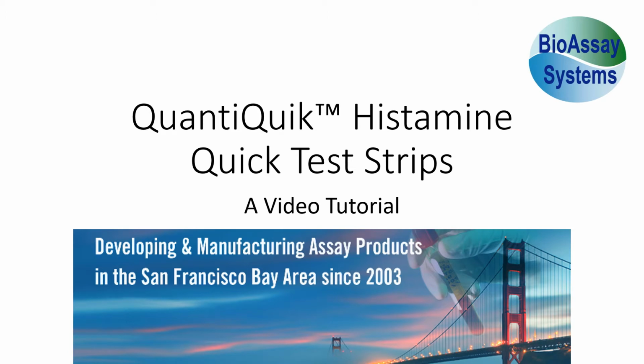The Technical Support Group of BioAssay Systems would like to offer our users a brief video tutorial in the use of our QuantiQuik Histamine Quick Test Strips.